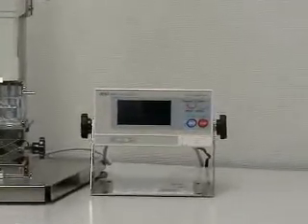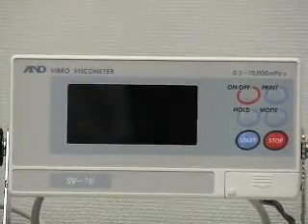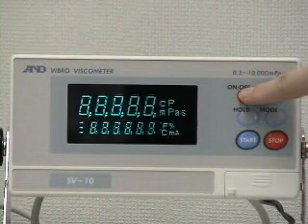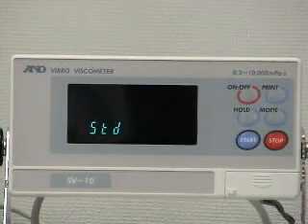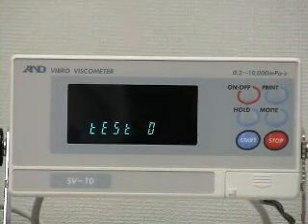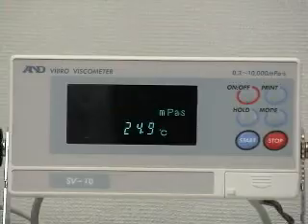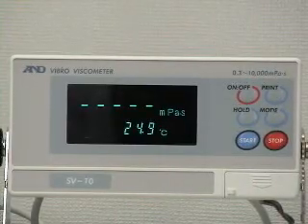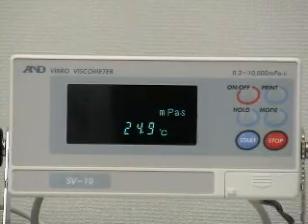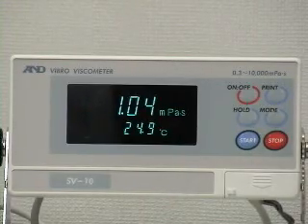The display unit has only six keys for simple and easy operation. Press the on/off key for standby mode. The vacuum fluorescent display is very clear and easy to see, to prevent reading errors. Press the start key to begin the measurement — the processing indicators will start to blink. Fifteen seconds later, the viscosity measurement value is displayed. The viscosity and temperature measurements are on a real-time basis.